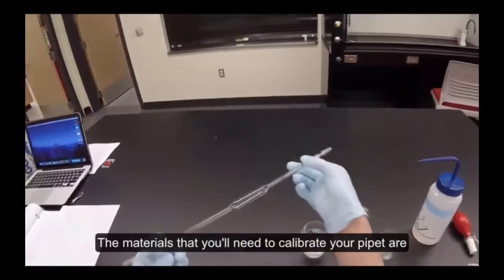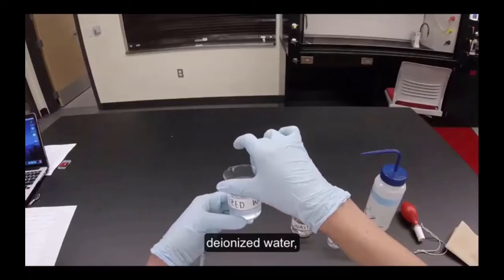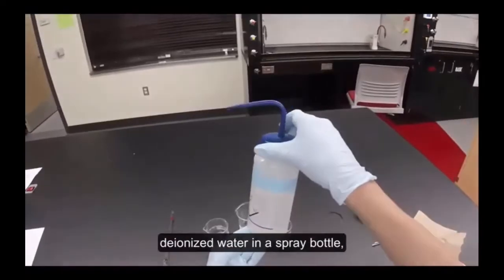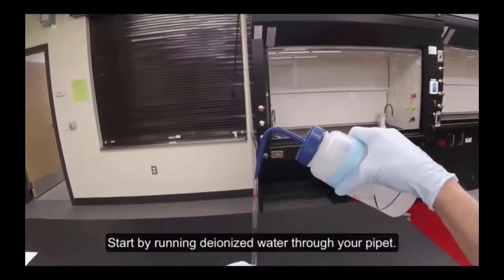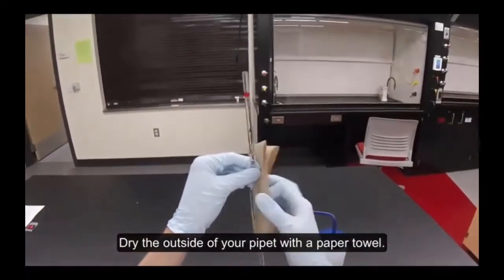The materials that you'll need to calibrate your pipette are your pipette, deionized water, a beaker for waste, a 50 milliliter beaker, deionized water in a spray bottle, and a pipette bulb. Start by running deionized water through your pipette. Dry the outside of your pipette with a paper towel.